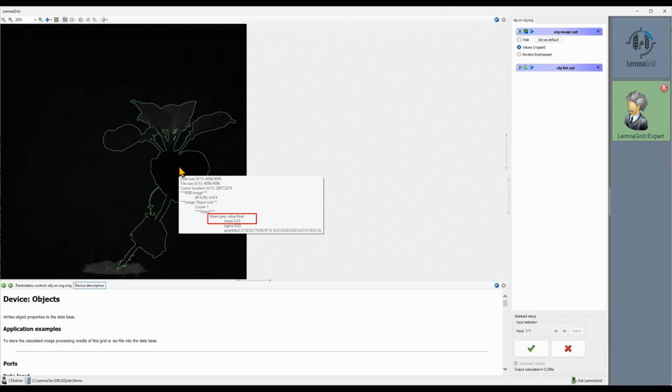That said, if you have a filter at 680 nanometers available in your system, far red with this filter may work as well, maybe even better than deep red, because the far red LEDs are much brighter to begin with.